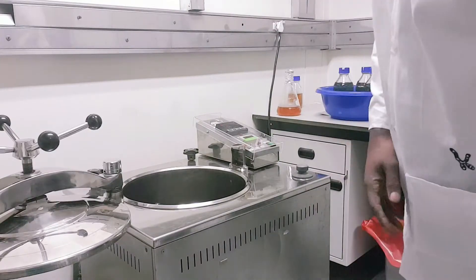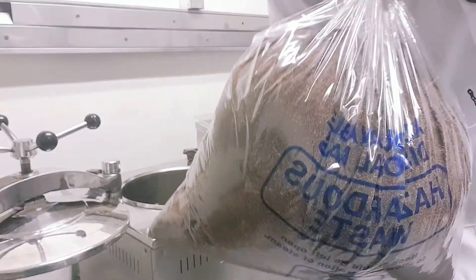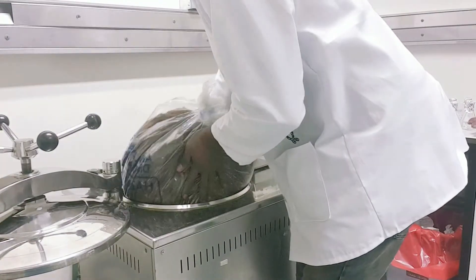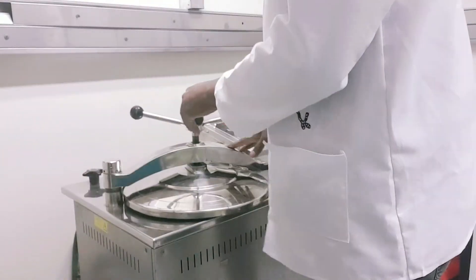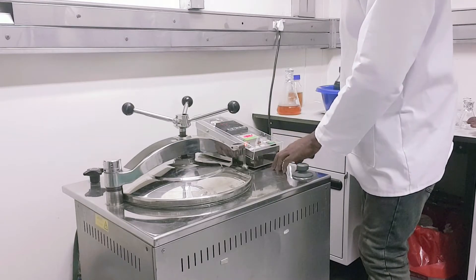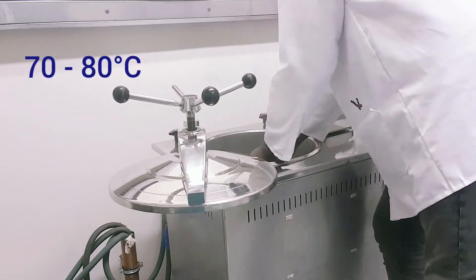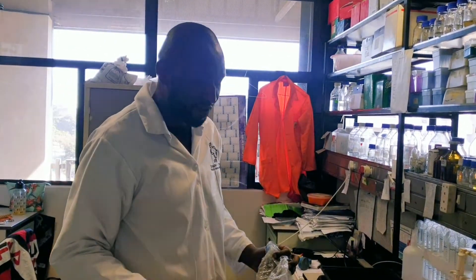We pasteurize the soil before we start planting, because we had experience where our soil had some kind of fungi that affected our plants. So what we do now is we pasteurize this soil at 90 degrees Celsius. We have our soil in the autoclave and we give it some time for the temperature to rise to 90 degrees Celsius. This here is the autoclaved soil.